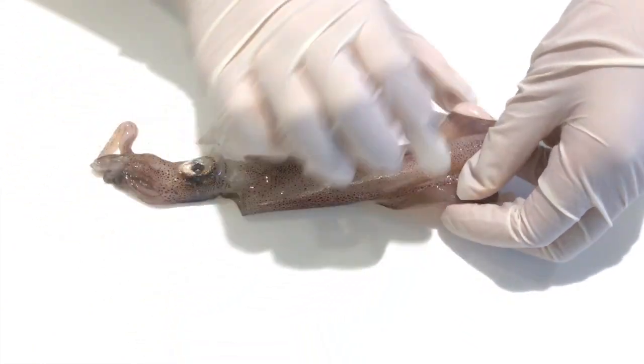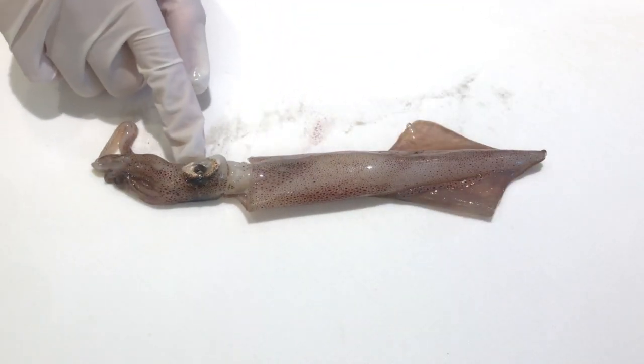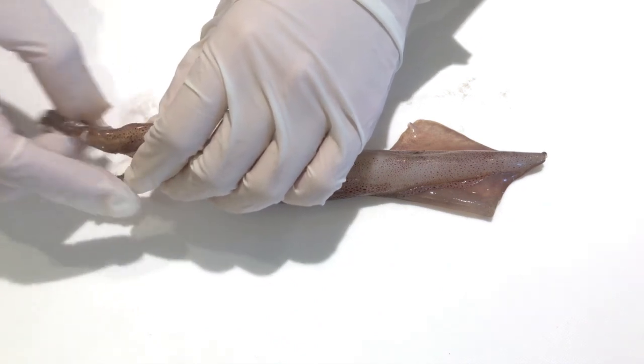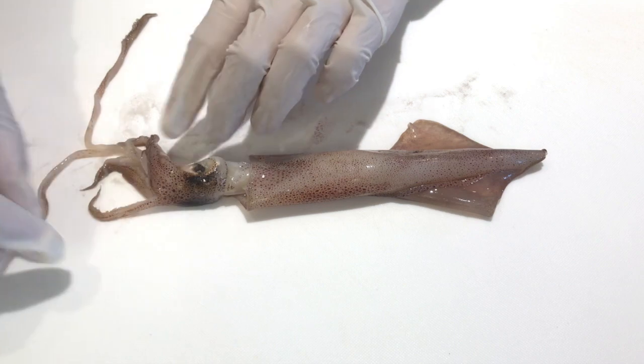So as you can see, these two are fins. That's the mantle. This is one of its eyes, and this whole thing is the head. These are its arms, sucker cups, and tentacles. The longer ones are tentacles.